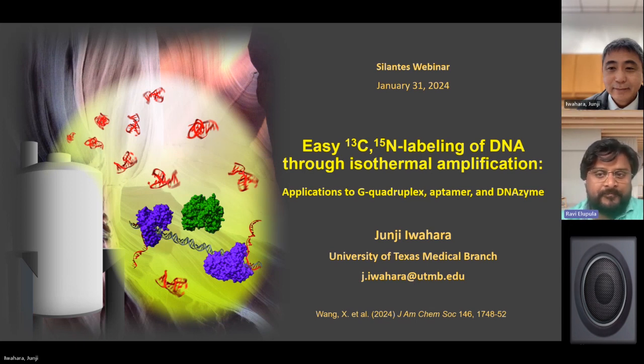Thank you so much. Thank you, Ravi. I really appreciate this opportunity for sharing our recent work with other people. Today, I'm going to talk about basically an isotope labeling method for DNA using isothermal amplification.